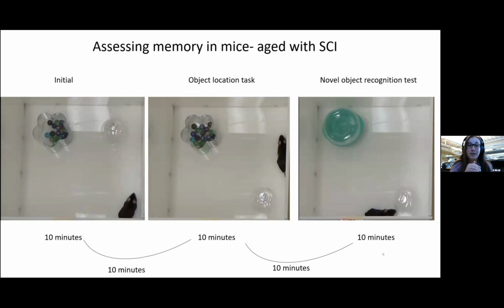Normally this would be done manually, which most people that have worked with animal behaviors would know is quite a pain, to assess where the animal's looking, if they're in the proper orientation, if they're close enough. That is one of the things that DeepLabCut is going to be great in general to help cut down on. So that's the basics. Okay, thanks, Sarah.